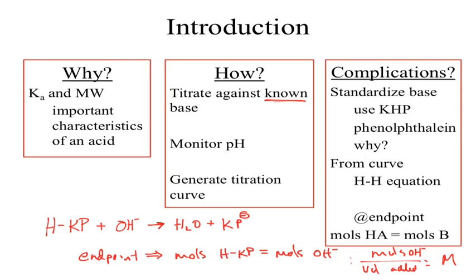That said, you have to be very careful with how you go through your titrations, and you have to be fast and effective. Some students are really good at rushing through and getting it done. Some students aren't. I'd leave that up to you to decide which category you fall in. If you don't feel confident rushing through it, then don't rush through it. You've got 2 lab periods to do it in. If you attempt to do the whole thing today but don't get it finished, guess what? You still get to show up Thursday.